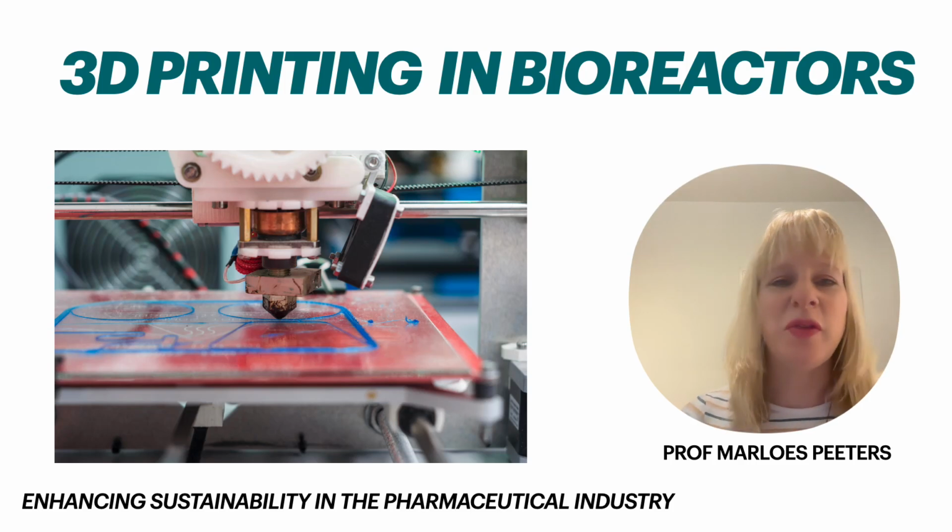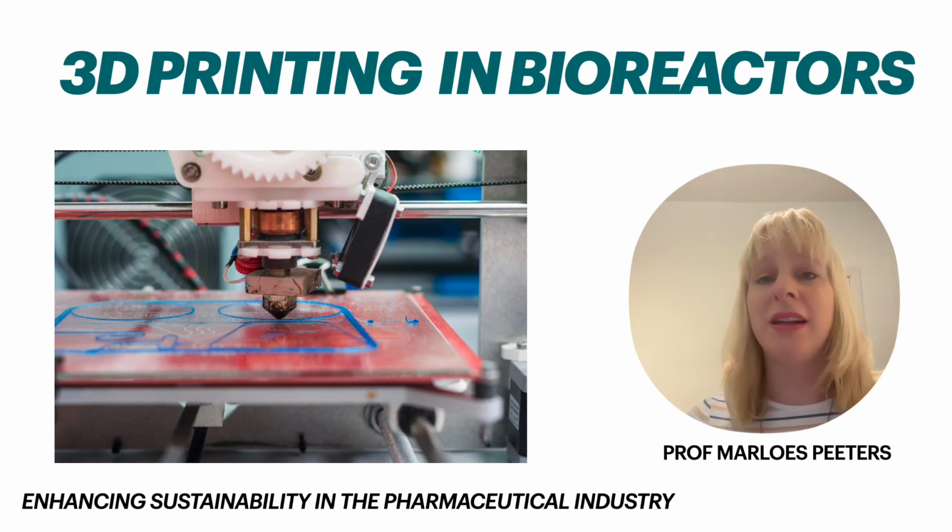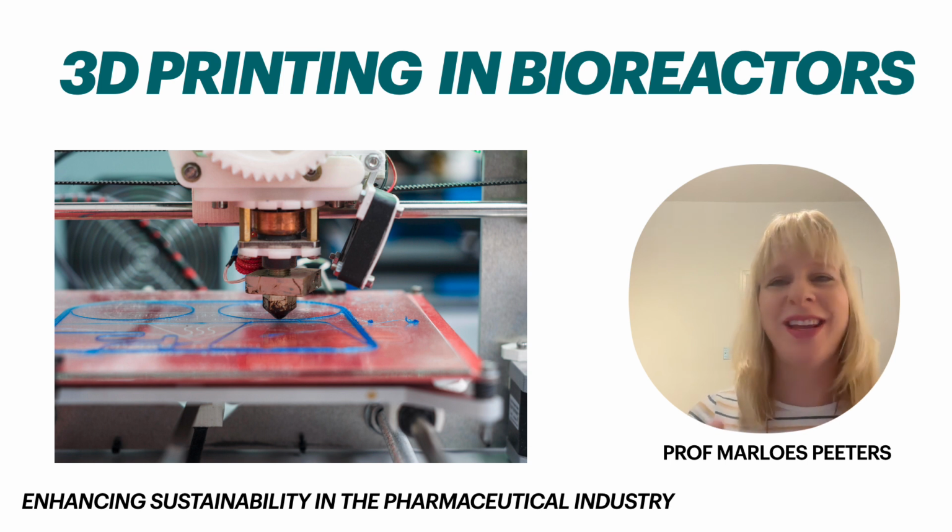I've done some previous videos on 3D printing, but that was mainly for outreach activities. In essence, 3D printing is creating a 3D object from a 3D model, usually using a CAD, so a computer aided design.